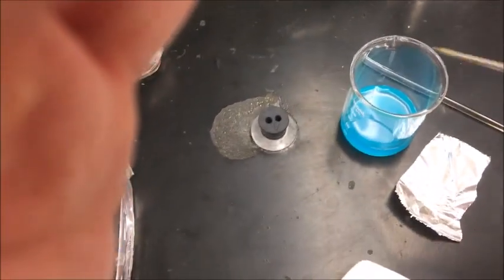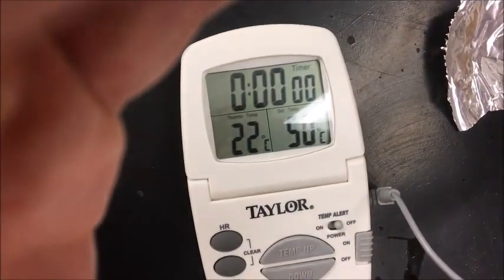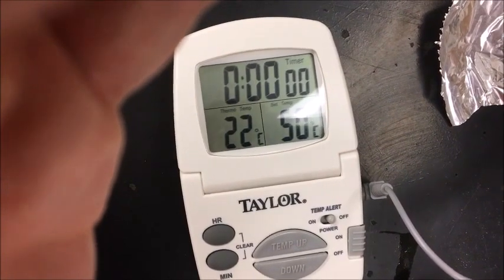First, we're going to record the temperature of the copper chloride. We'll put this in here. It will be about 22 degrees — 21 degrees Celsius.